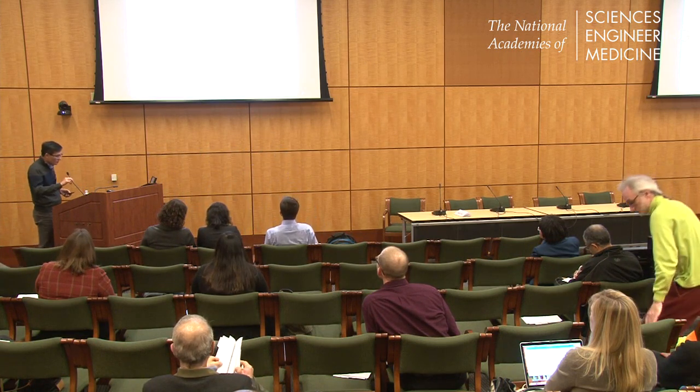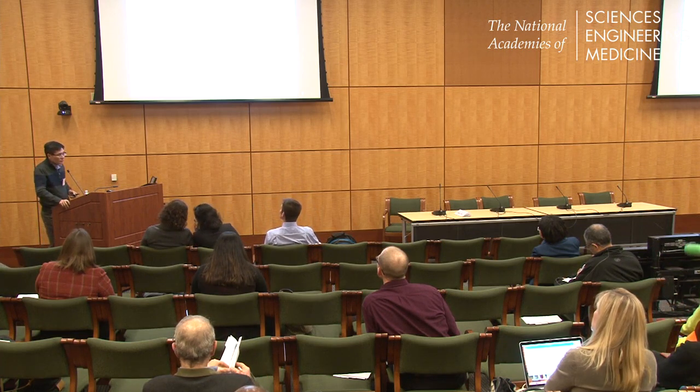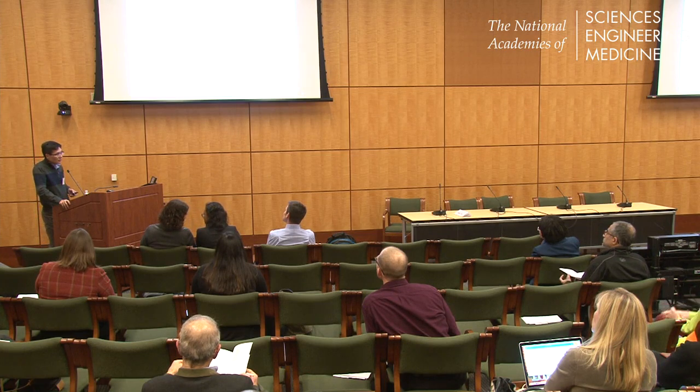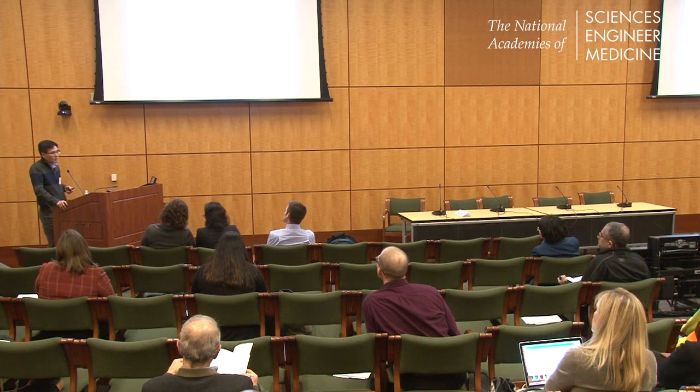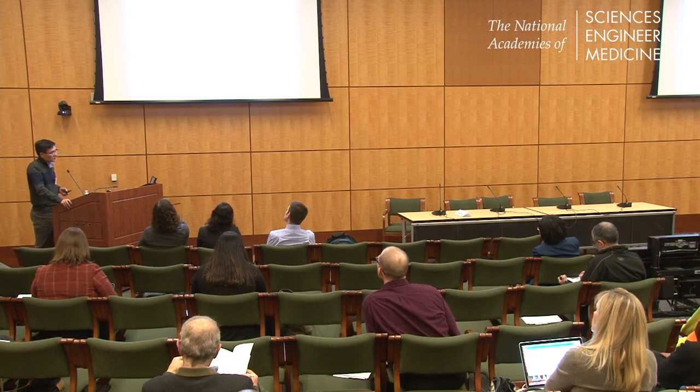Good afternoon. Today I'm going to tell you a story that's currently under review, not yet published, but I hope it can help illustrate how we can use CRISPR genome editing tools to help us understand the mechanisms of toxicity, in this case of one environmental toxin, arsenic. In fact, the approach I'm going to describe is very similar to what Chris just described. So actually, you make my work much easier, and hopefully some of the stuff I'm going to describe will be easier to understand.